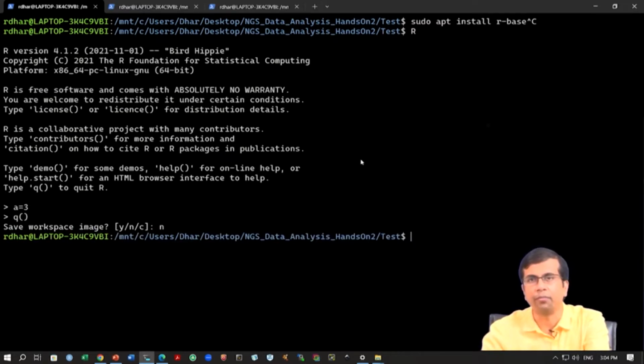Okay. So, it is that simple, but if you have a very long R code to run, let us say you have generated a very long code of R, then you probably do not want to run it this way, right. You have to copy and paste all those things. So, that is very cumbersome. So, you can run it as a script here. Okay. You can simply run, let us say, R -f and then the script name. Okay. So, this is also possible. We will not get there because we are not going to write very complicated scripts. I will show you small scripts one at a time, and we will run and execute those, and we will generate some of the results.